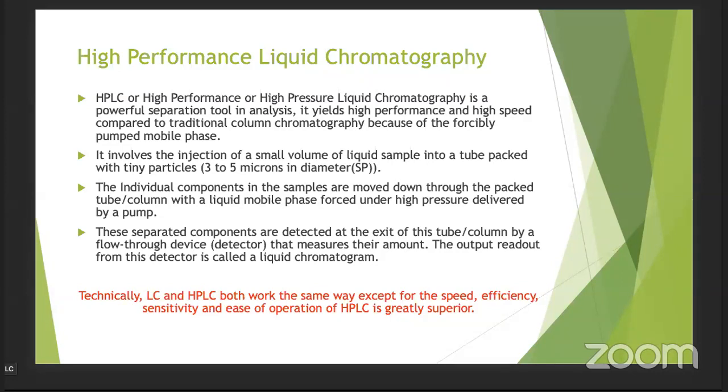Later, in a further stage, a concentration gradient is also used. Initially, when you start an HPLC, you use a mobile phase which is hydrophilic in nature and has around 90% water. Now, as the process continues, you start decreasing the percentage of water and start increasing the percentage of organic solvent up to a limit of 90%. And when the organic solvent is around 90%, the complete column cleanup will be done this way. So every component that was present in your mixture will be eluted out.